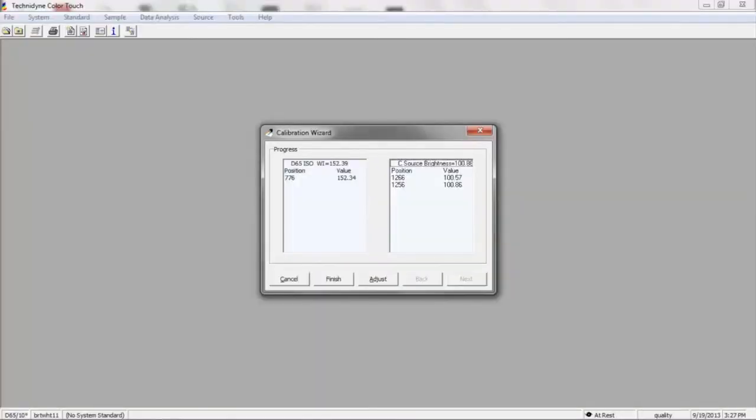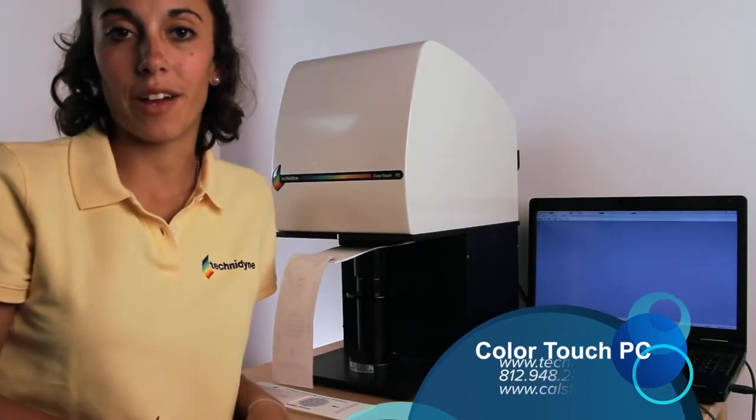Once that's done, we can press finish, and it should take you back to the home page.